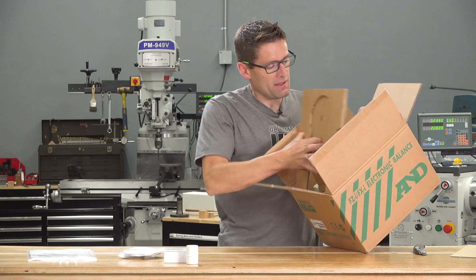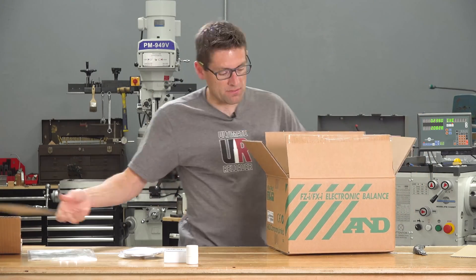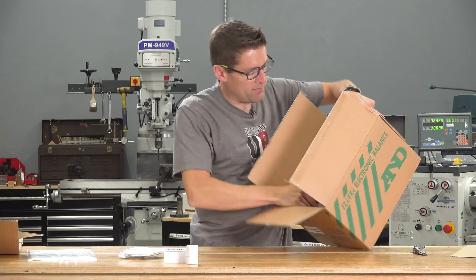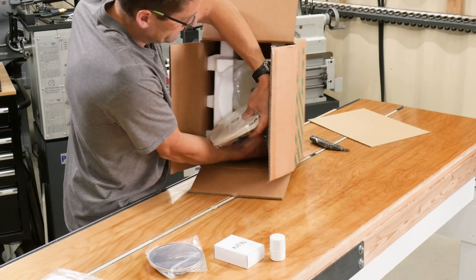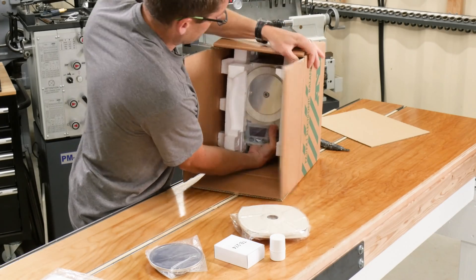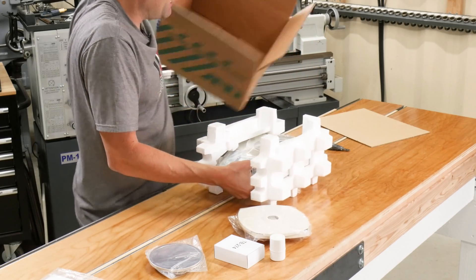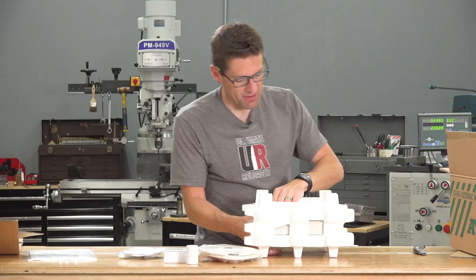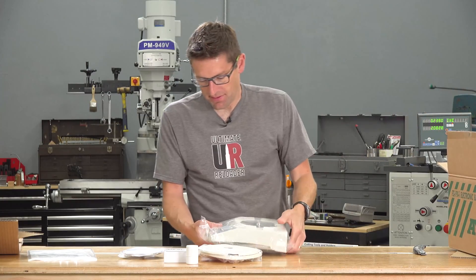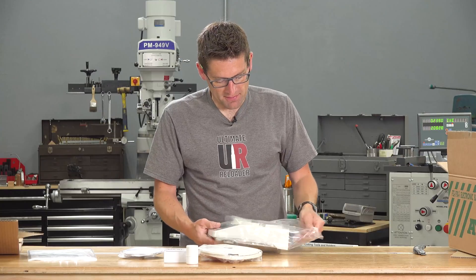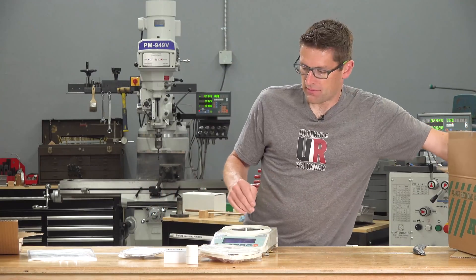A bit more packaging here. Let's see if I can show you this coming out here. A little bit of silica gel in the bottom there. Oh, she's a beauty. Look at that.